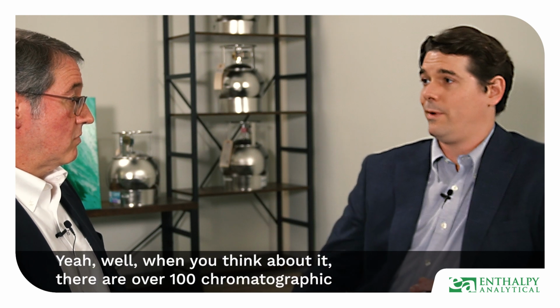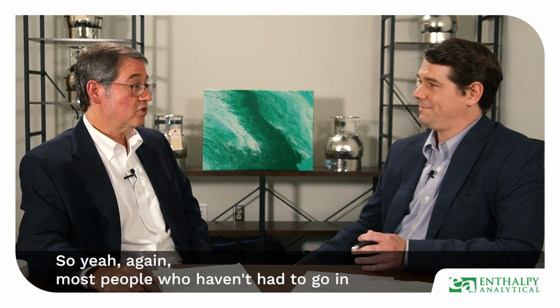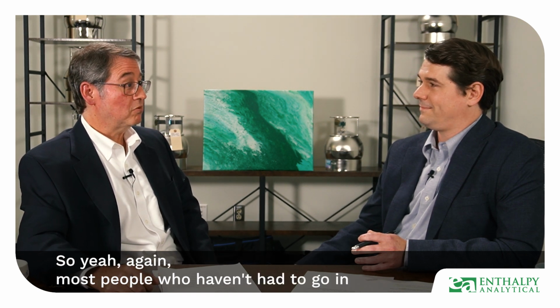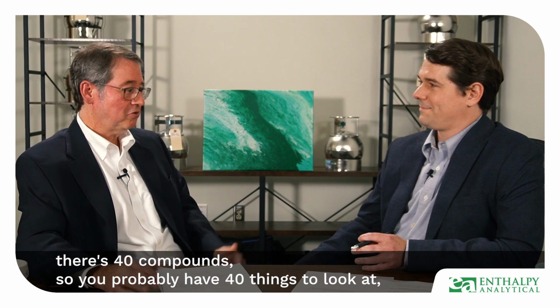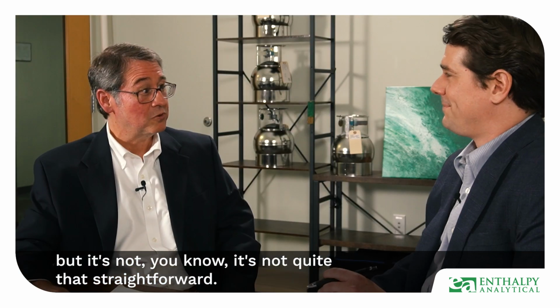And then validation. Yeah, well, when you think about it, there are over 100 chromatographic peaks generated for every injection for 1633. Over 100. So, again, most people who haven't had to actually operate an instrument probably wouldn't think that. You think, hey, there's 40 compounds, so you probably have 40 things to look at. Right. But it's not quite that straightforward.